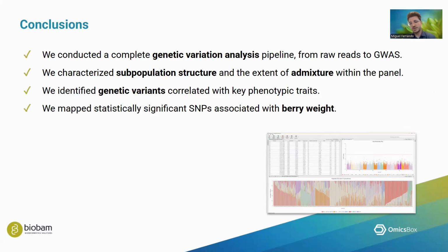I think this is a good starting point for other downstream analysis, such as enrichment analysis, as I said, with tools like MAGMA.